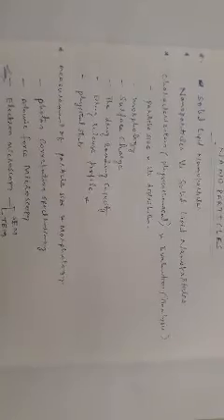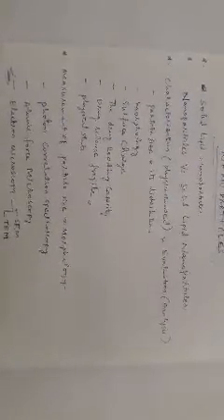Zeta sizer is used for measuring size distribution, dispersion properties, stability, and propensity to aggregate of nanoparticles in a nanoparticular dispersion or particles of nanomaterials. This helps in the design and development of new nanoparticles or new nanomaterials.